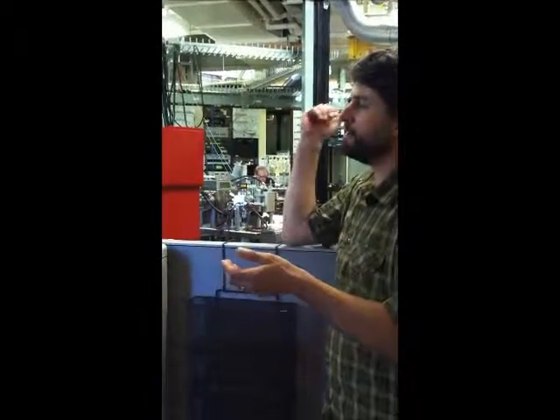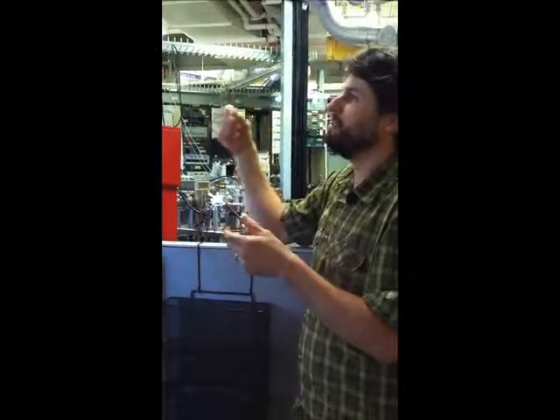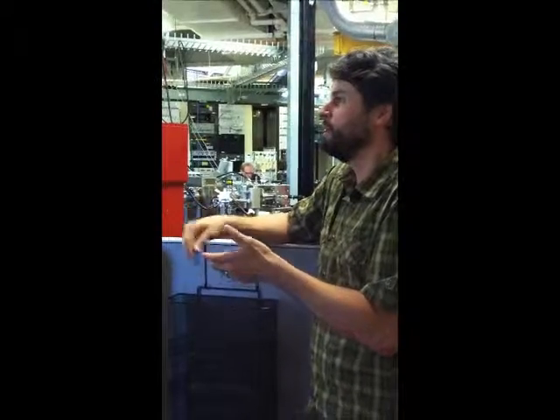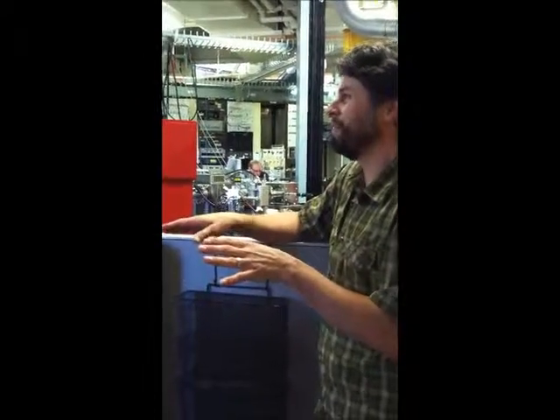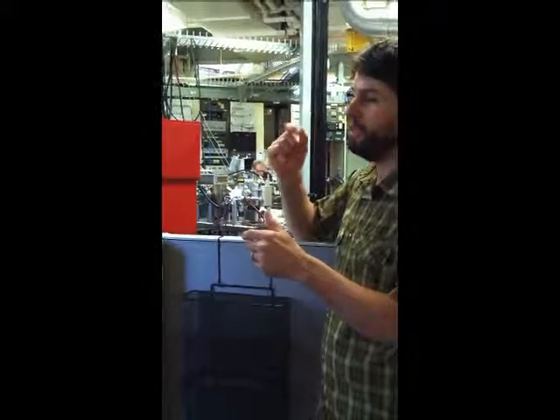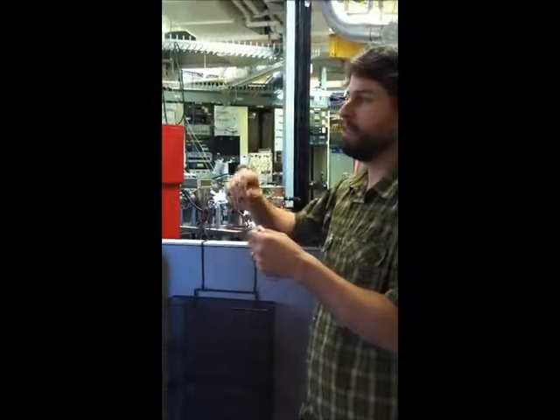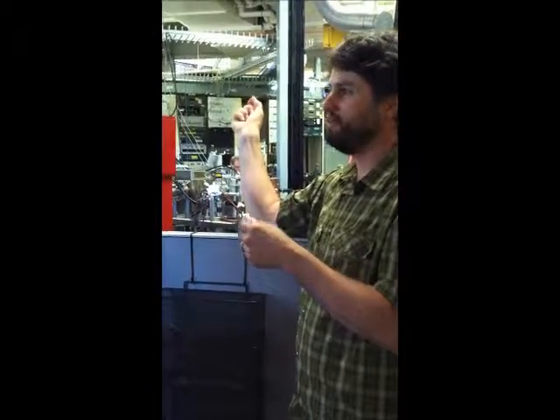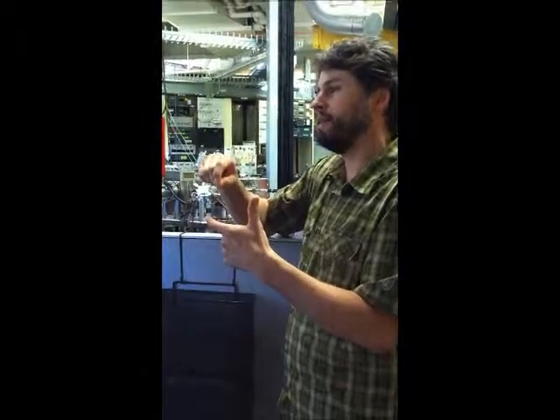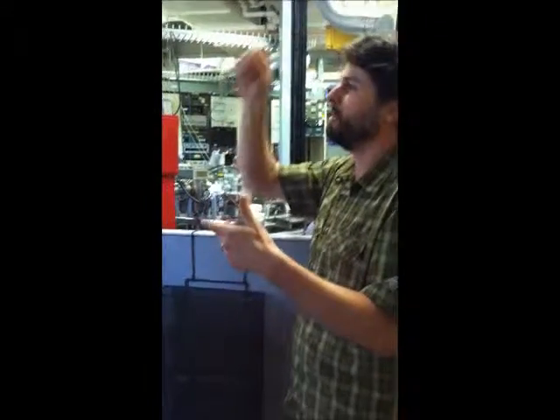And the X-rays that come out of the machine, or ultraviolet light, I'll just say X-rays to keep it simple, have enough energy that they can penetrate into materials and they can disturb the electrons that are involved in an atomic bond. One of two, roughly, things can happen. The photoelectric effect, which Einstein got a Nobel Prize for: the X-ray can hit that electron in the bond with enough energy that it ionizes it, kicks it completely out. You can then study the energy of that ionized electron and deduce something about the energy of the bond that you're trying to study. Or the electron can get excited to a higher energy shell and then cascade back down to its ground state, emitting photons as it goes.